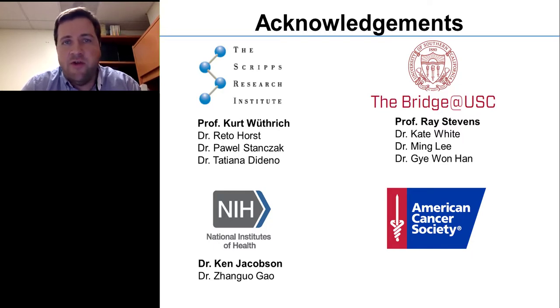In addition to that, other techniques are emerging from other research groups whereby they're able to incorporate stable isotope labeling into insect or mammalian cell expression systems as well. So that may also open up additional doors for future NMR studies of different human GPCRs.